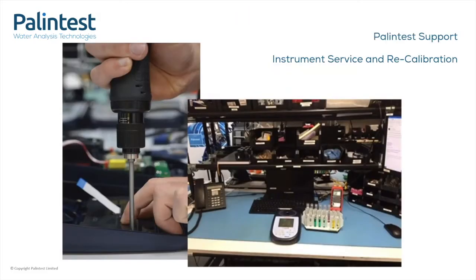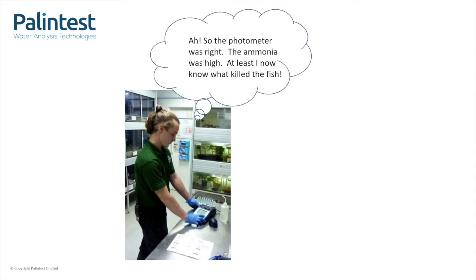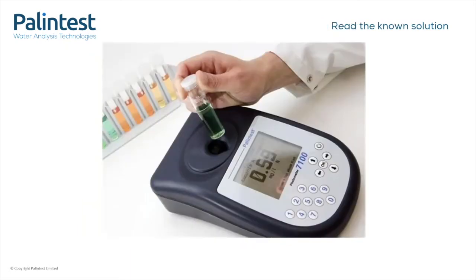Well, you could send your instrument back to us for a service and recalibration. But unless you have a backup — and let's face it, who does — you'll be without your instrument for a week. And when we send it back to you, if you are still getting those unexpected results that led to you having doubts, then you'll know that a week ago your photometer was fine, and those high readings really were high. You could instead prepare a known solution of whatever it is you are testing for. For example, if you are doing ammonia testing, you make up a one milligram per litre solution of ammonia. However, this is not an easy thing to do, and the result you get on your photometer may tell you how well your photometer is reading, or it may tell you how good you are at making up one milligram per litre solutions of ammonia.